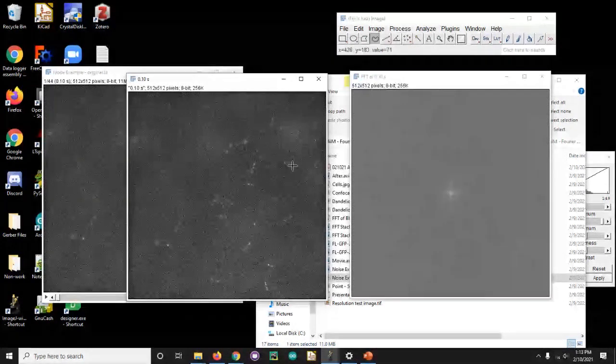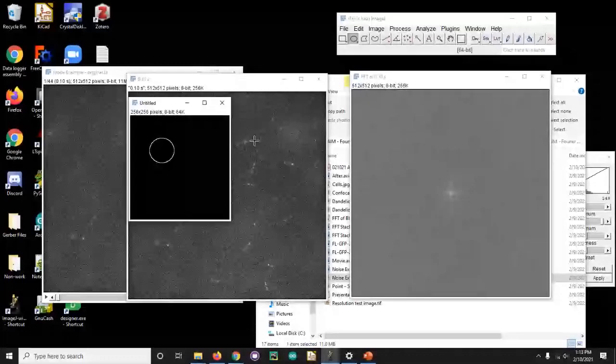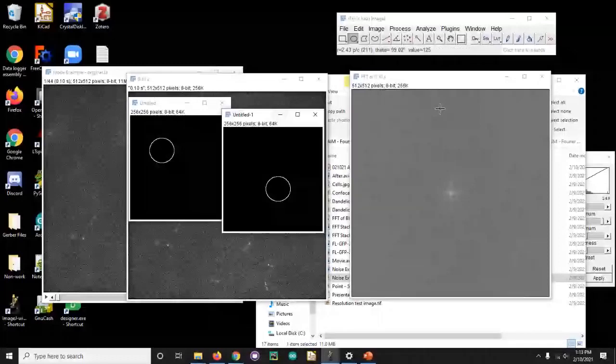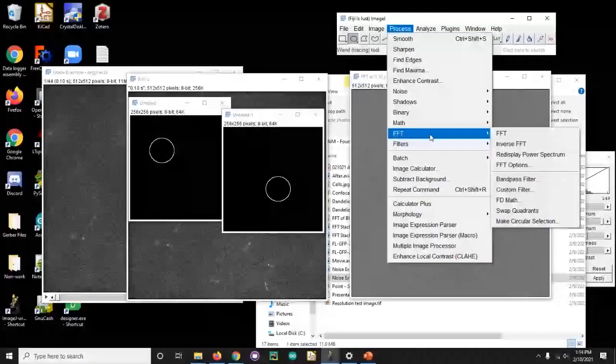You can't do it. Then one follow-up question that you might ask is, well, we have an issue, which is, how does a Fourier transform distinguish between an image like that and an image like this? It's the same frequencies. So how do you then encode positions, translation of something? And so what's not being shown to you, you can get it by going back into the FFT options, and it's the complex Fourier transform.